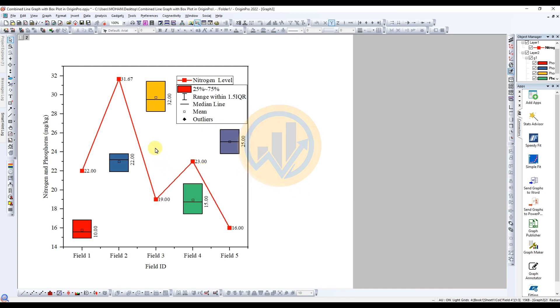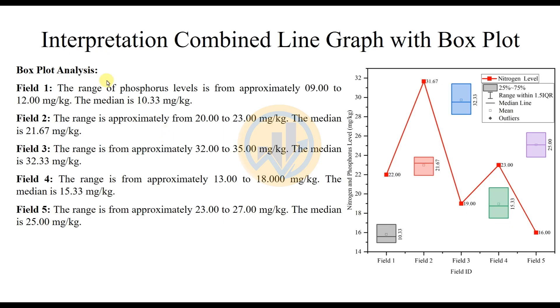This is the creating method for the combined line graph with the box plot in OriginPro software. Next, we move to the interpretation section for the combined line graph with the box plot. First, we analyze the box plot interpretation, then the line graph, and finally the combined interpretation.